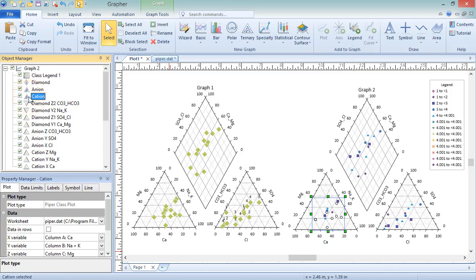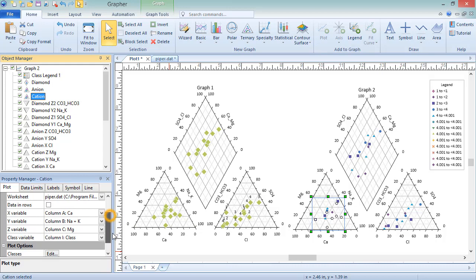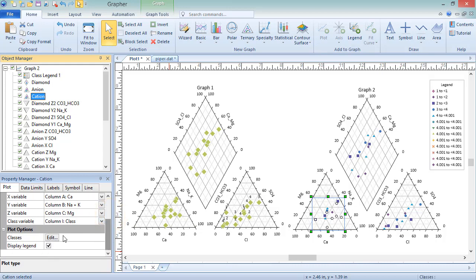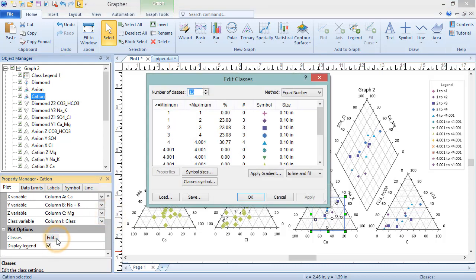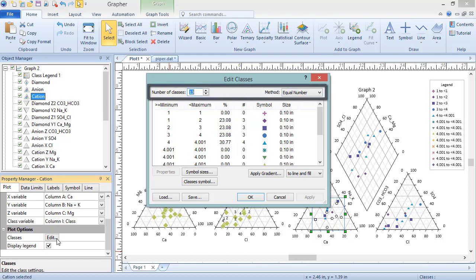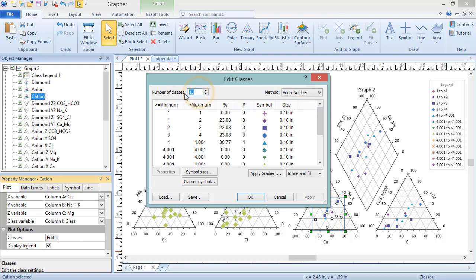To edit the classes, click the Edit button in the Classes field. In the Edit Classes dialog, the number of classes and the class method are listed at the top. These determine how many classes you have and how the data entries are split up into the classes.